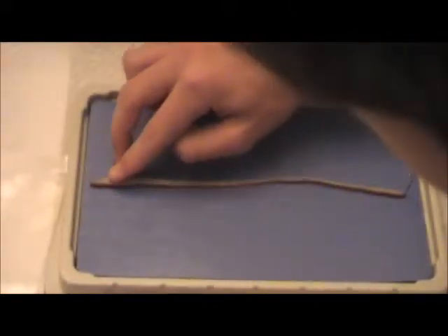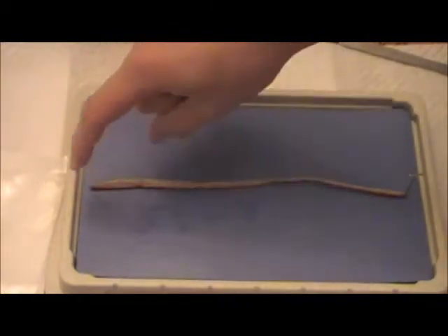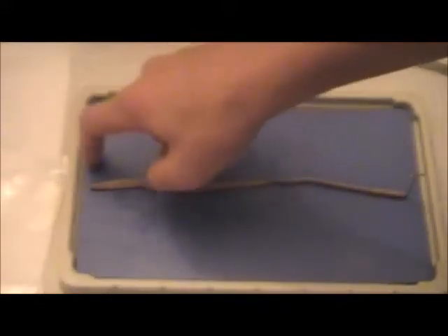Doesn't smell too bad. It smells a little like pickles. Pin the posterior part of the worm right there. And so basically all the organs are going to be from here to here. So you want to avoid damage in that area, including the head. So I'm not going to pin the upper part, the anterior part of the worm. Anterior is the upper part where all the main organs are. Posterior is like the intestines and the digestive tract. And also be careful with your scalpel, it's extremely sharp.